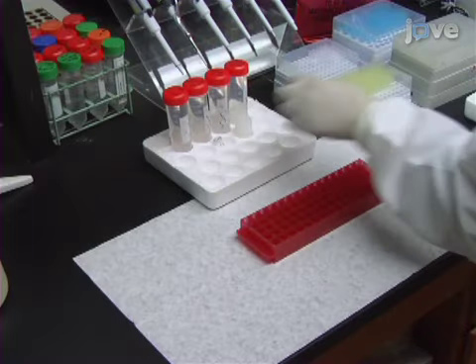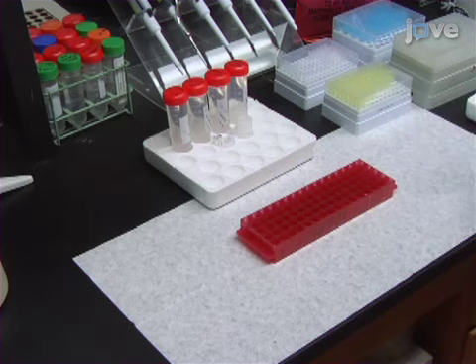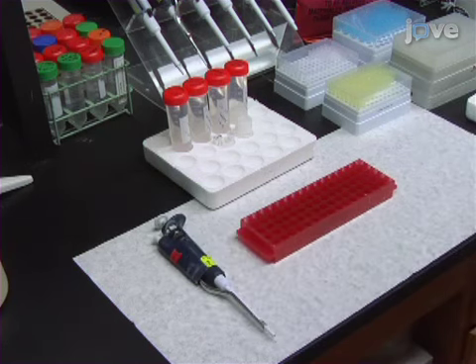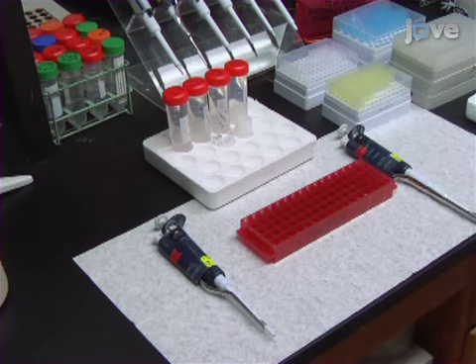The co-IP for isolating motif binding partners is a difficult step. Make sure that the beads are properly agitated during incubations, and that as much liquid as possible is removed from the beads during each wash step.